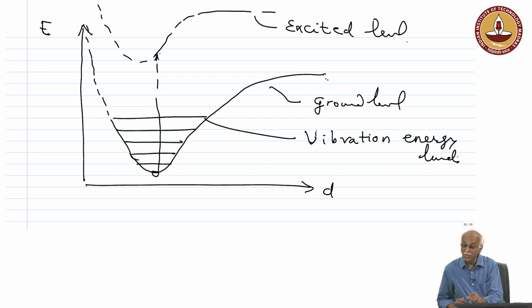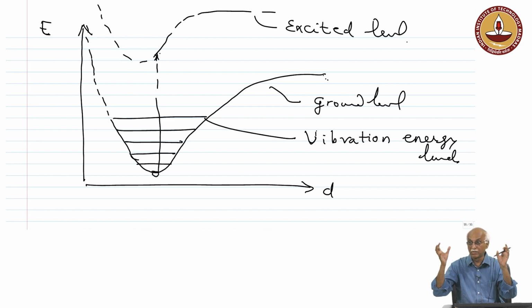These vibrational energy levels are nothing but stretching of atoms in the molecular structure. When an electromagnetic wave comes, it interacts with the molecular and atomic structures, and they start oscillating. It can be stretching, symmetric or asymmetric, or it can be rotation also. If it is linear stretching, the vibrational energy level comes into picture, and within that vibrational energy level there are molecular rotational energy levels.